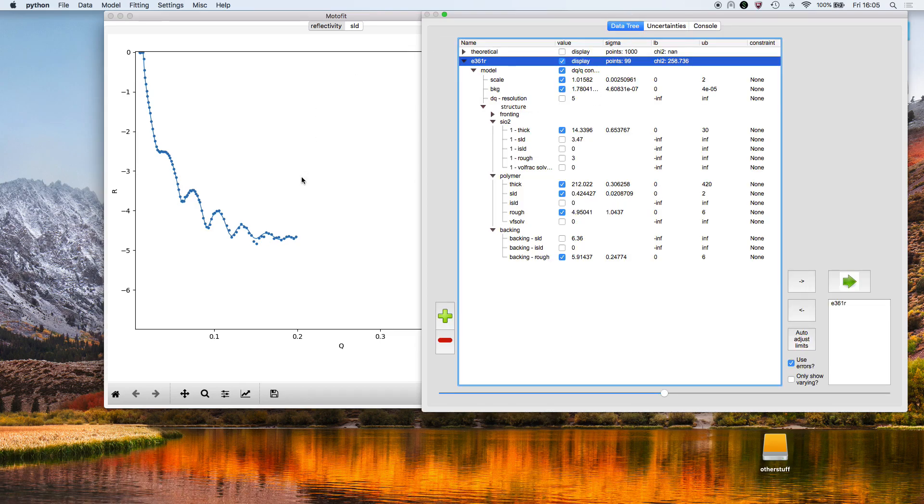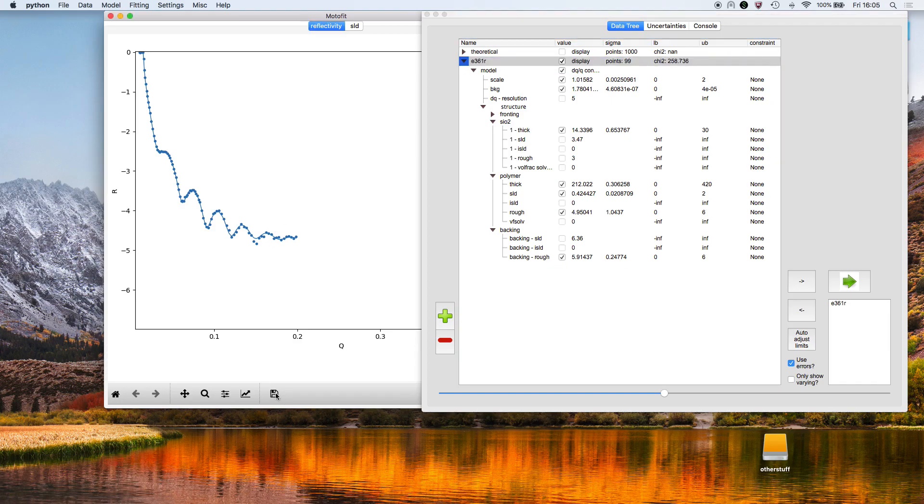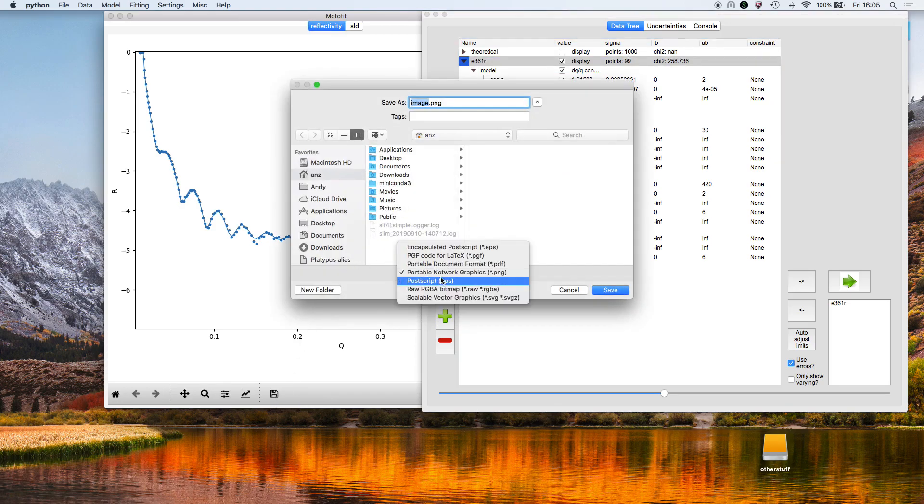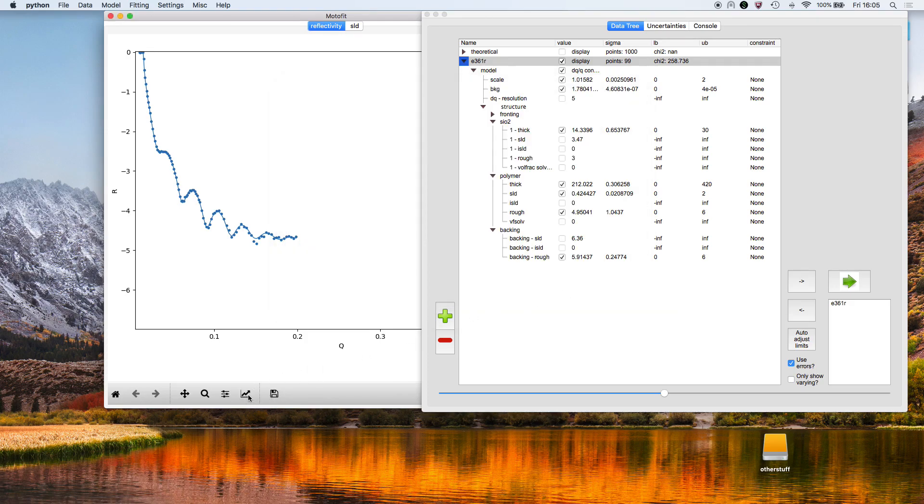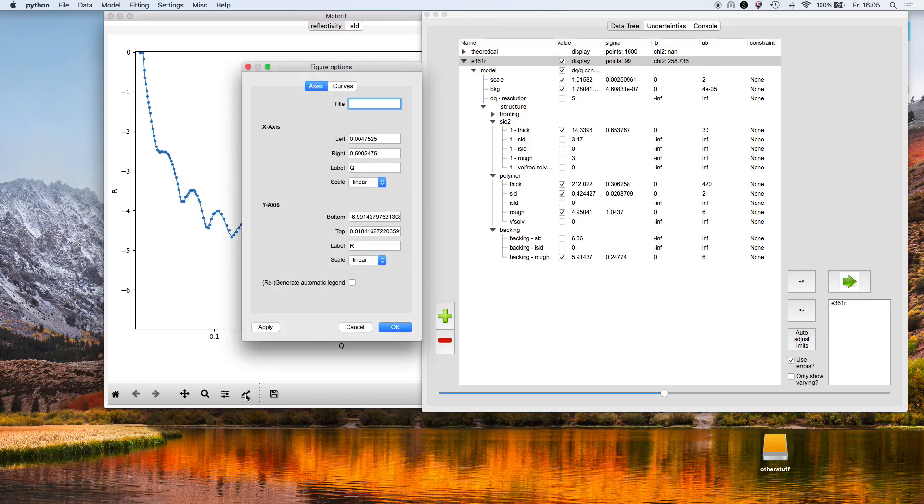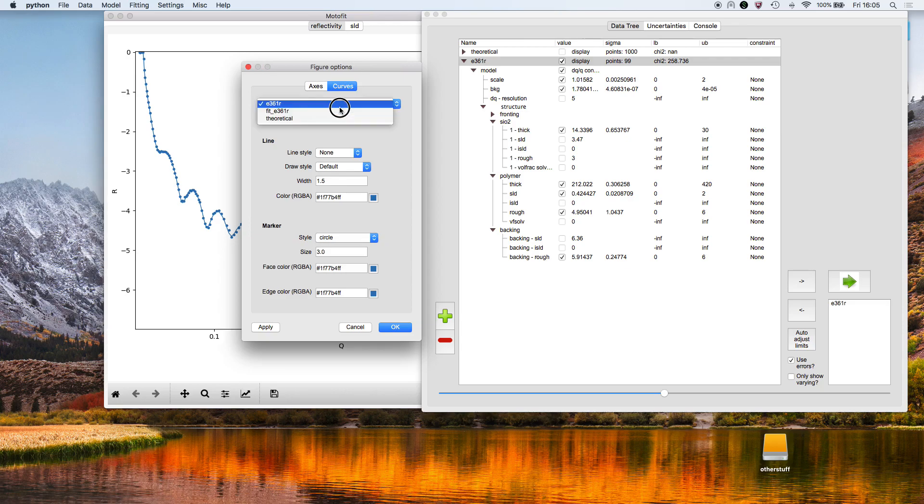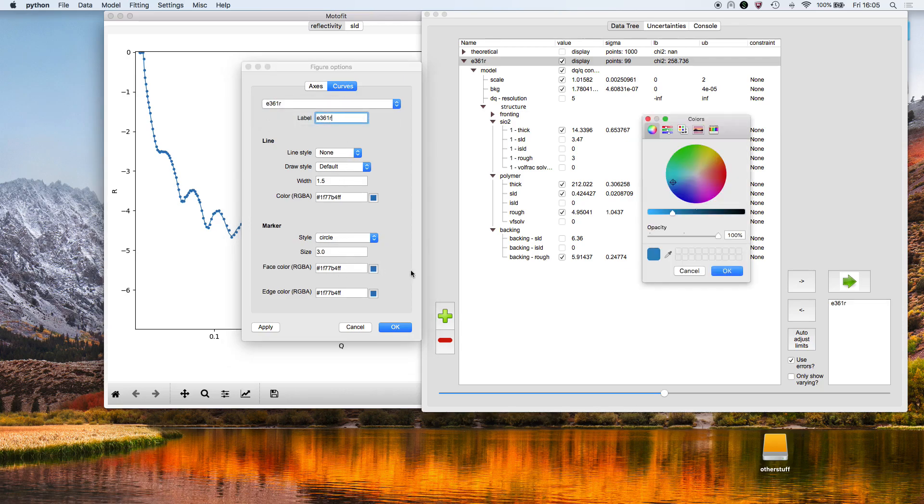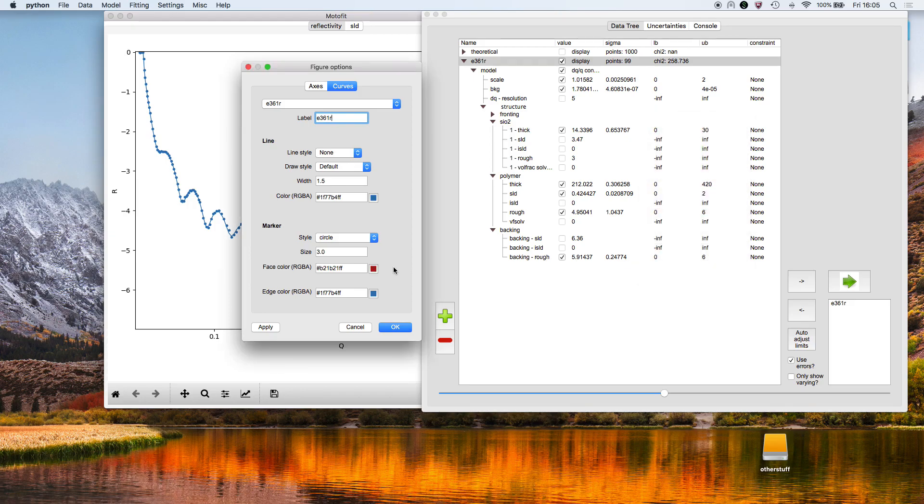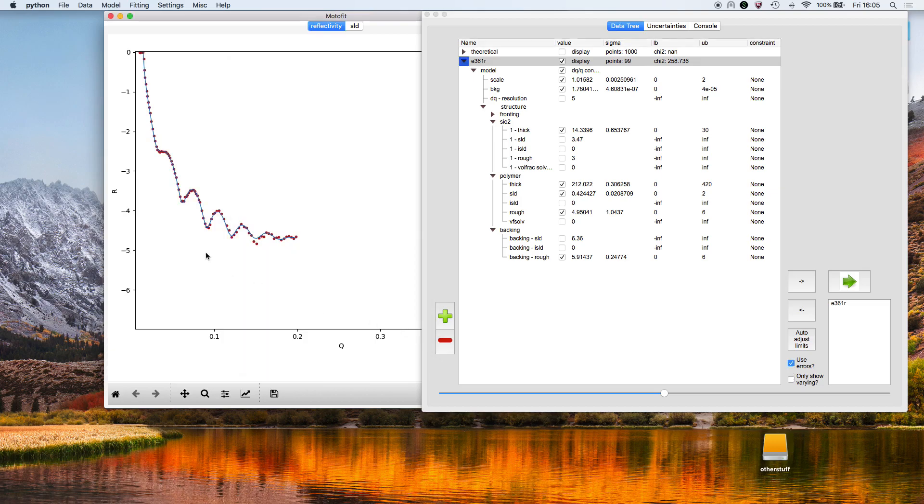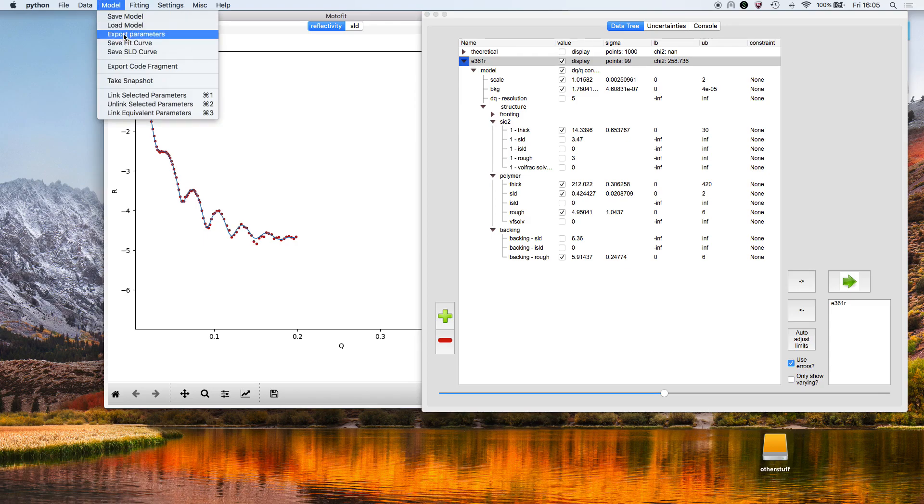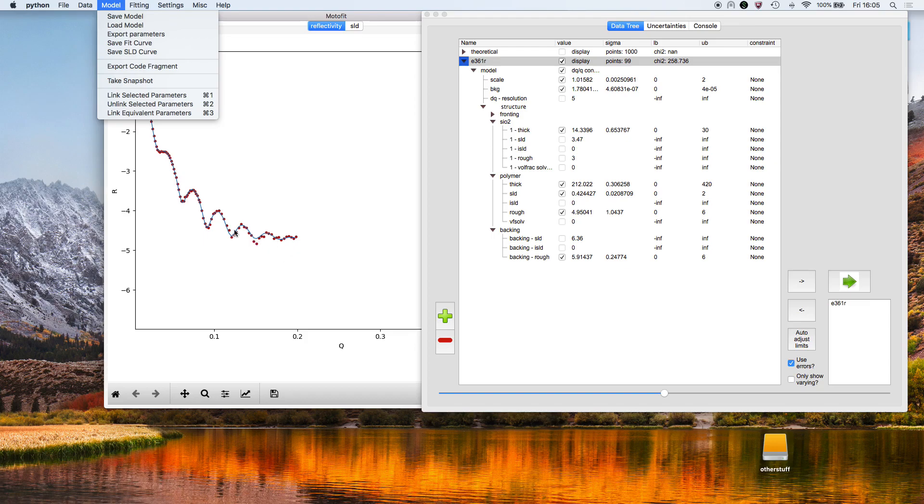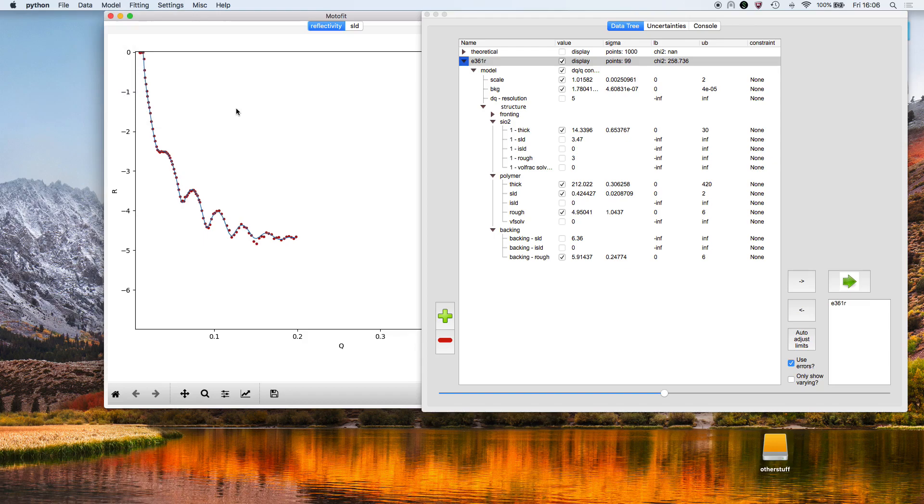You can then export the data or save the figure—say SVG or PNG. You can change the color of the graphics by choosing a color with a color picker. We've now made it red. We can save the model, export parameters, save the fit curve—the fit curve would be this blue line here, and so on.